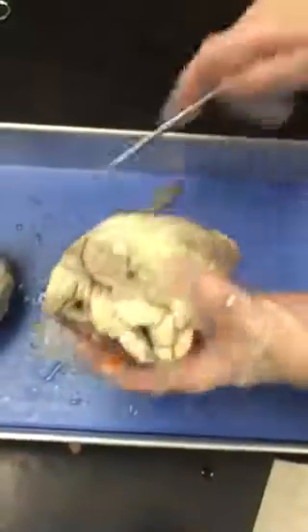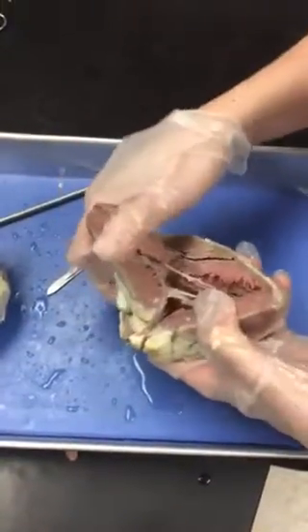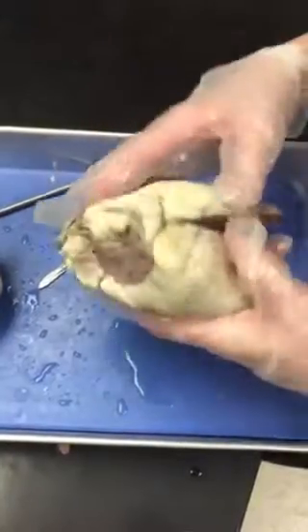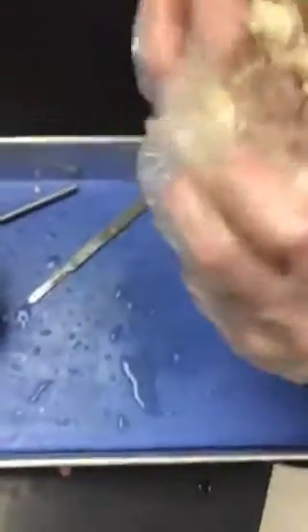44, reattach any labels that may have come off both hearts. Have your teacher check your dissection and your external labels. Follow your teacher's instructions and clean up.